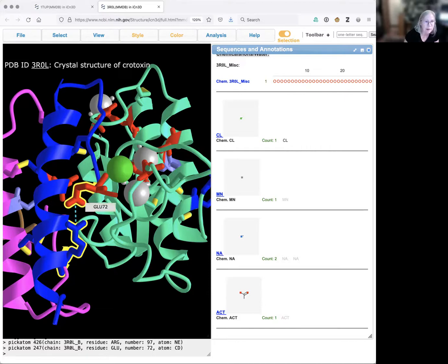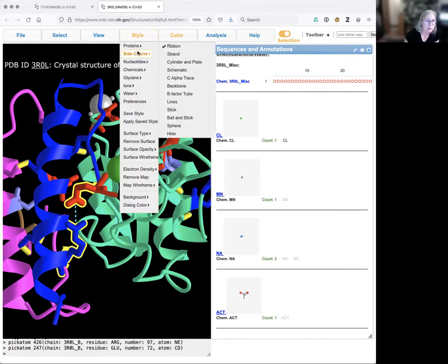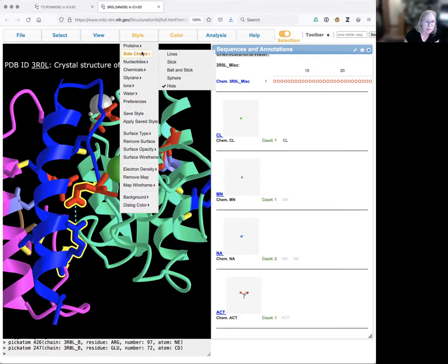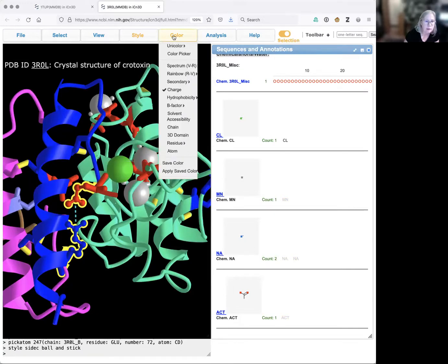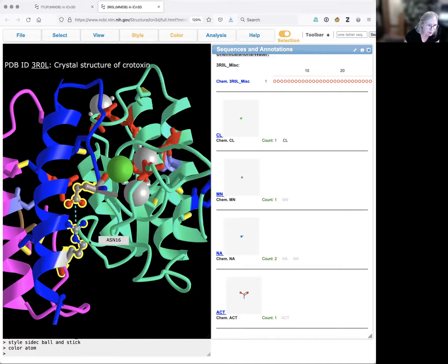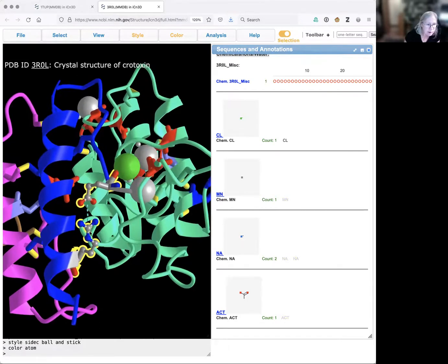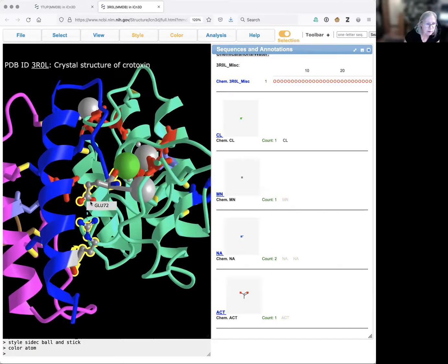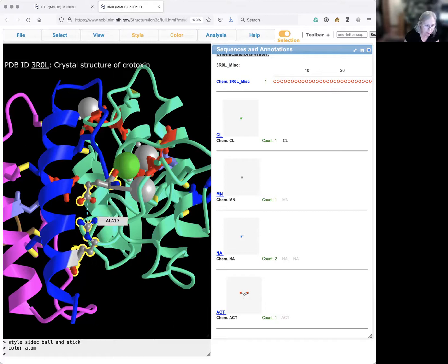To look at these a little bit more, I'm going to change the side chains and make them ball and stick, and I'm going to color this by atom. I can see here that I've got oxygens where there can be a negative charge. It can alternate between these. This is my carboxyl group. And here I've got nitrogens on the arginine.